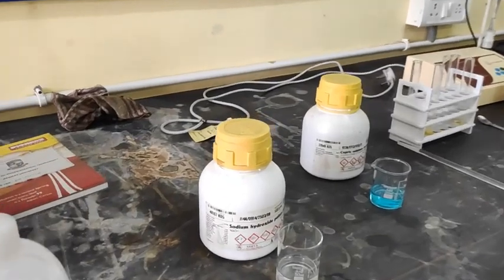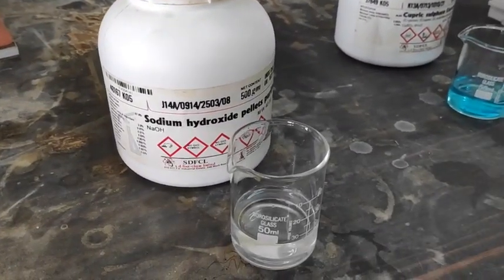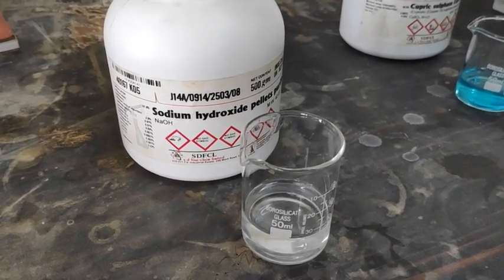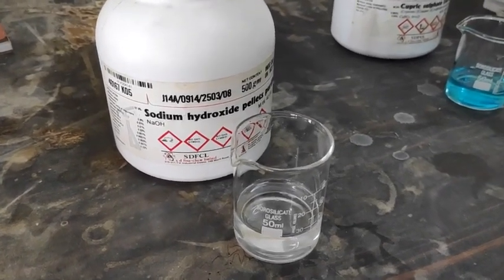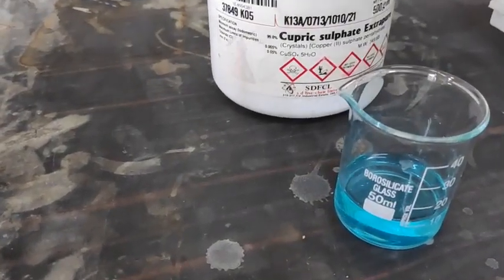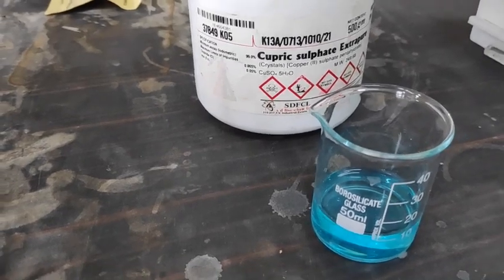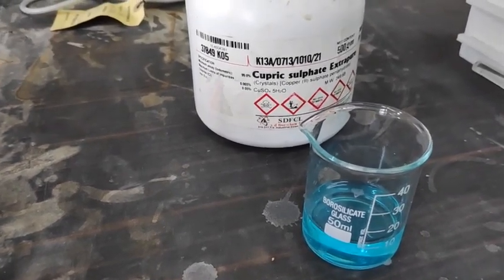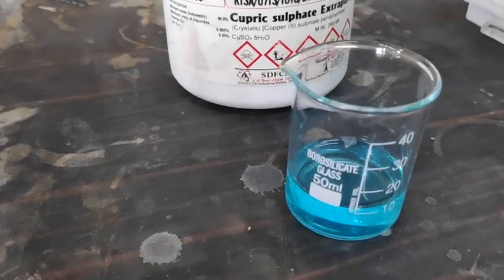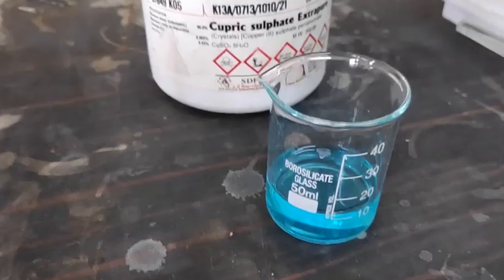For this purpose we have created a concentrated sodium hydroxide solution, around 40% weight by volume. The second thing is copper sulfate, which is also known as cupric sulfate. The term extra pure means that there is a high amount of purity of the cupric sulfate. As you can see, this is a blue solution that has been created.